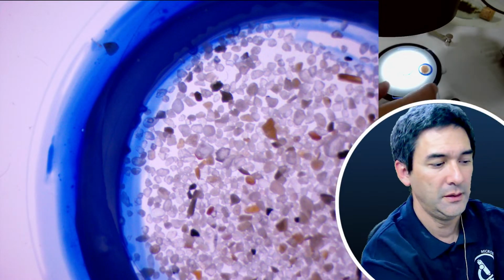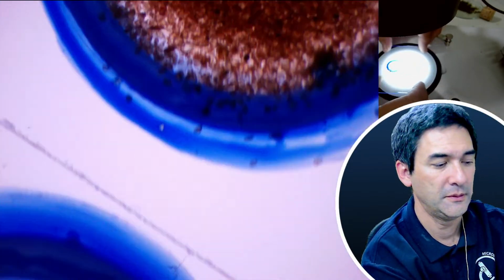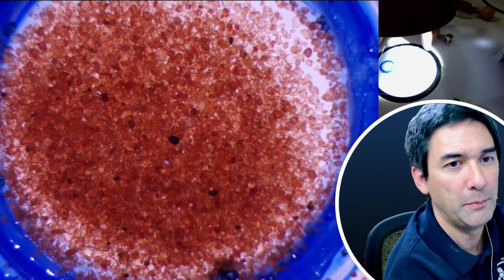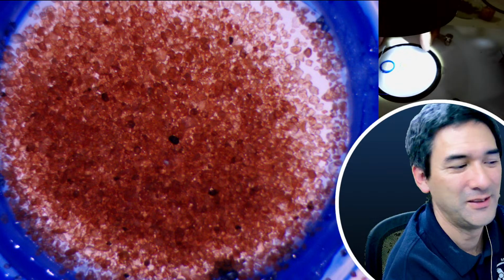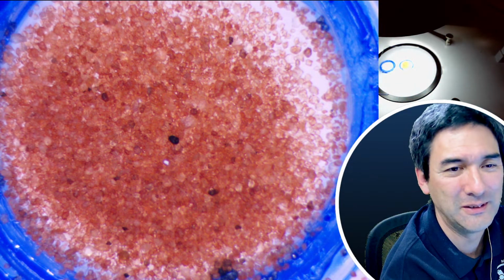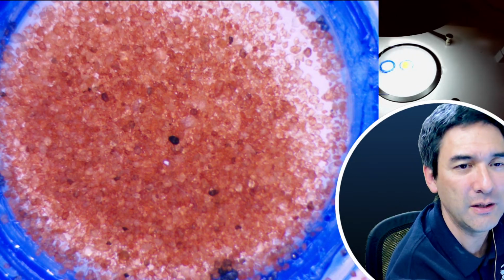Okay, this is how it looks from the bottom now. And top and bottom, and ring light. You know, this is way too strong now. Right? So you see there are different ways of how you can actually try this out.